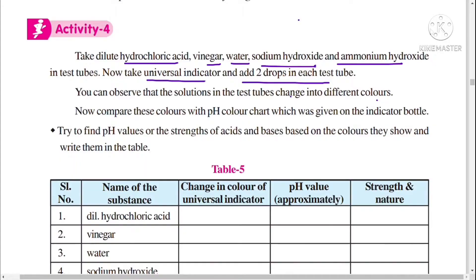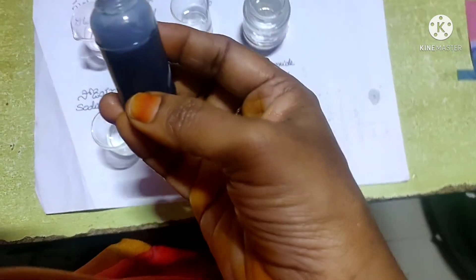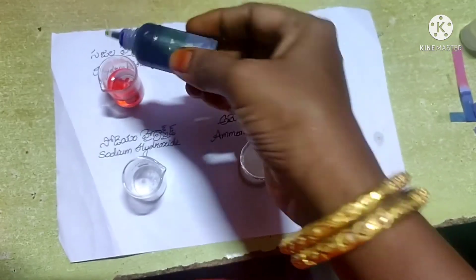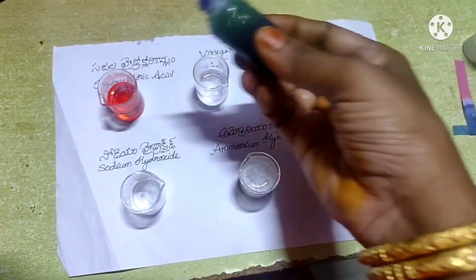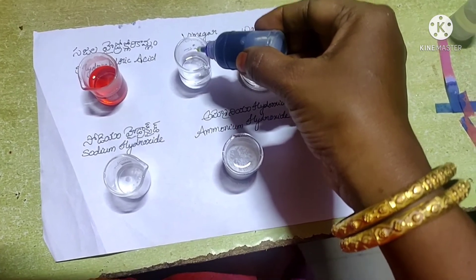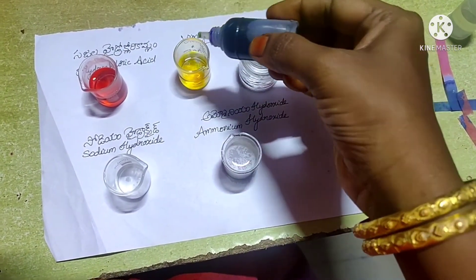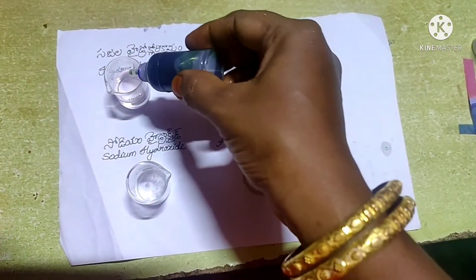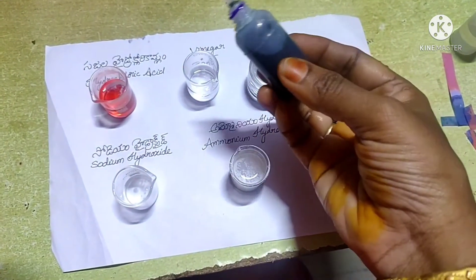For this activity we need different types of solutions, a universal indicator, and a pH scale. First, take dilute hydrochloric acid, vinegar, water, sodium hydroxide, and ammonium hydroxide solutions in beakers. Add two drops of universal indicator in each test tube, then by using the color changes we can find the pH value. First observe with the dilute hydrochloric solution.